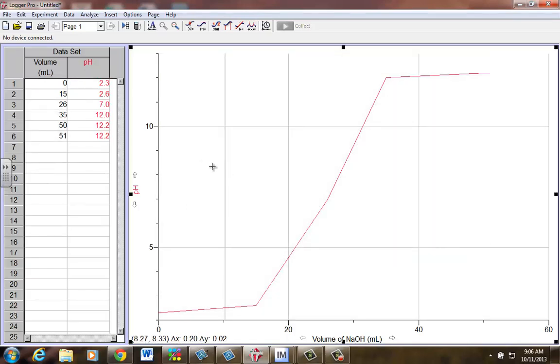Alrighty. So you've done that. Pause the video if you need to. Take a moment. Get your XY axes labeled and punch in all of those numbers that your team generated for the process of your trial of titrating. When ready, just start up the video again.